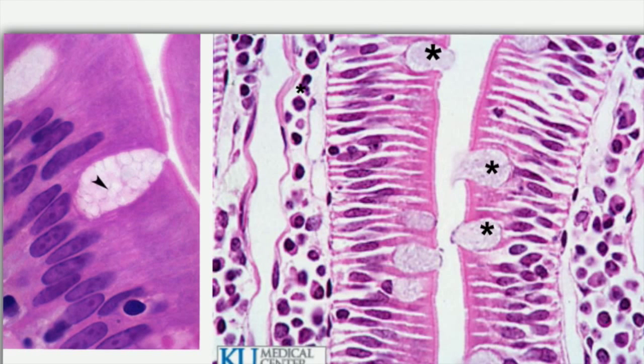This picture is very nice, demonstrating the goblet cells here. This is the upper expanded part.